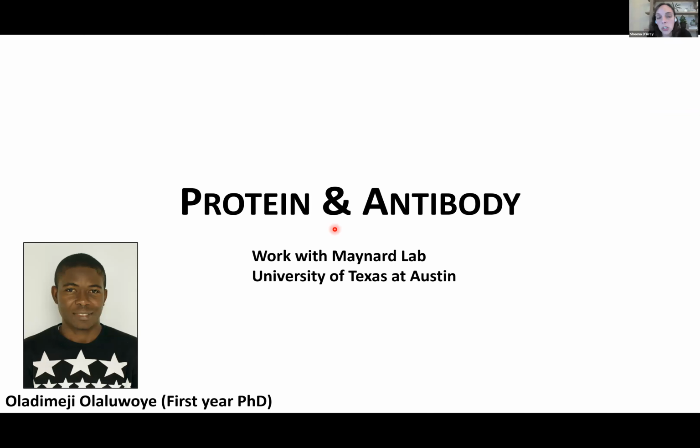This one is going to talk about epitope mapping, basically where we're looking at a protein alone and a protein with its antibody. This application is slightly different from a typical protein-protein interaction because here we're not always interested in getting the peptides back from the antibody. If you do a protein-protein interaction, you often want to get peptides from both proteins, map the interface and then potentially model it. But here we're not necessarily that interested in the antibody, so it makes it a little bit easier. But antibodies also have disulfide bonds, so you have the added step of making sure you really reduce those disulfide bonds before you put your sample in the mass spectrometer.